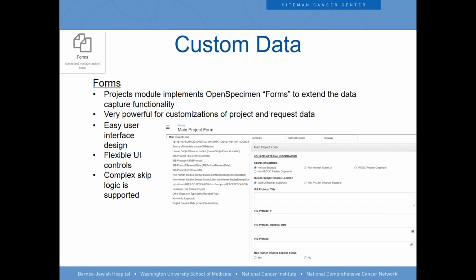So again, this is the basic functionality, and it's a hierarchy like this. I put some screenshots on here just to give you a flavor for what it looks like in the application. At the highest level, we have a concept of a project. A project is just a container for reusable service requests.